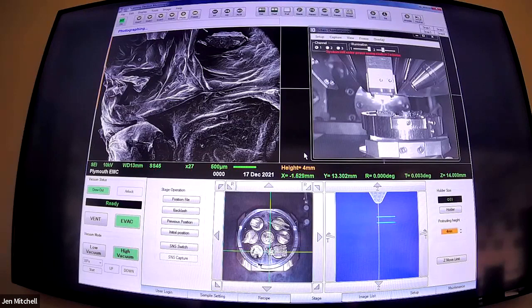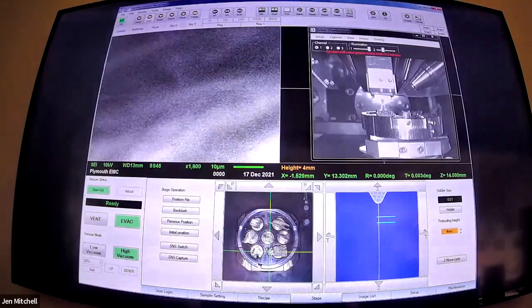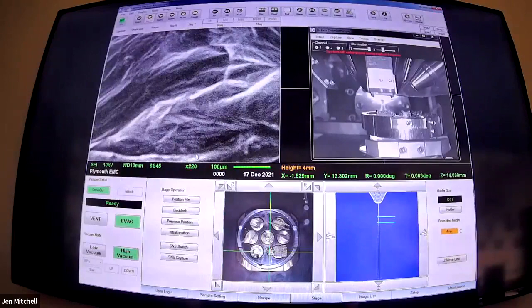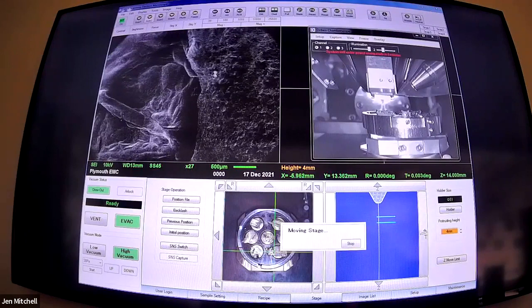The maximum magnification of this microscope is something ridiculous - in theory SEMs can get up to a million times magnification. This one it looks like goes up to 300,000 times - which is probably optimistic for a tungsten instrument. Some of our field emission instruments, which have a much smaller and brighter spot of electrons, we can definitely get into the half a million range and get useful information. There's a distinction between what magnification you can go up to and what magnification is actually useful.